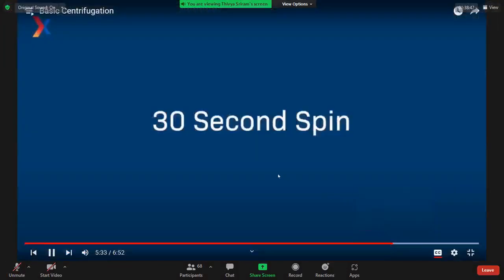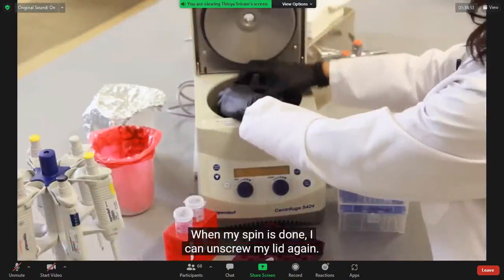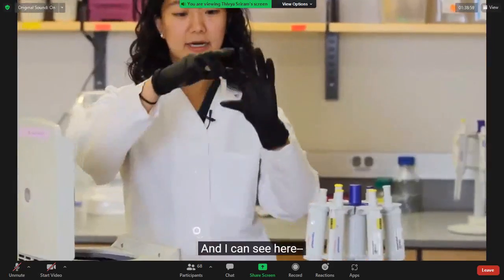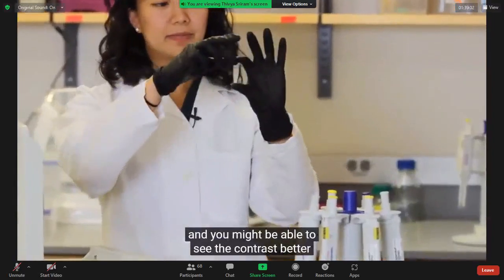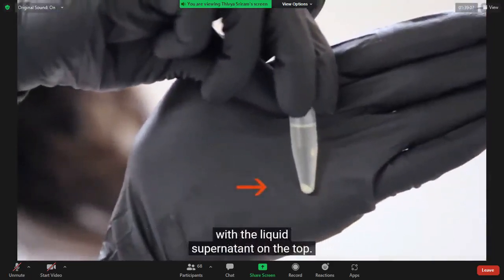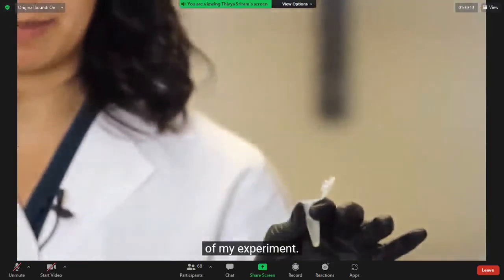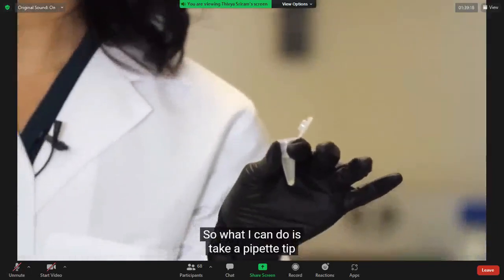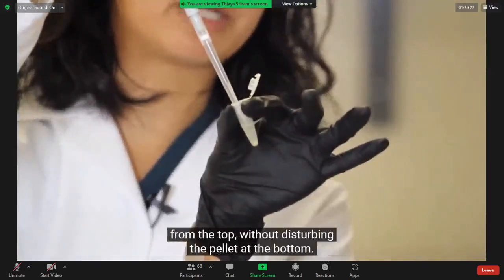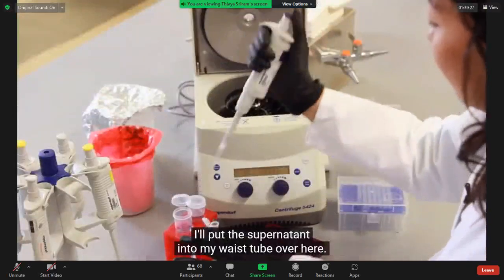The second application. When my spin is done, I can unscrew my lid again, and I can see here, and you might be able to see the contrast better against the black gloves, where I created a pellet of the bacterial cells at the bottom, with the liquid supernatant on the top. I don't want the supernatant for the purposes of my experiment, so what I can do is take a pipette tip and be very careful about removing the supernatant just from the top without disturbing the pellet at the bottom. I'll put the supernatant into my waste tube over here.